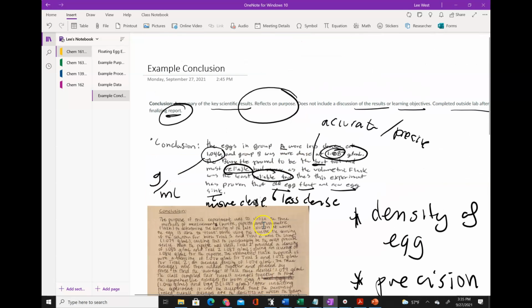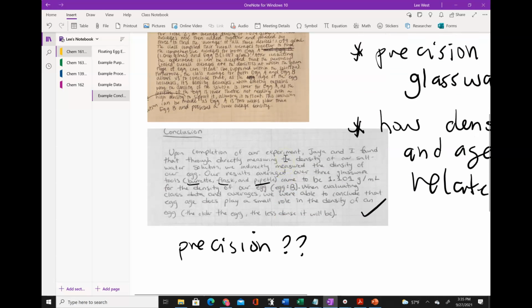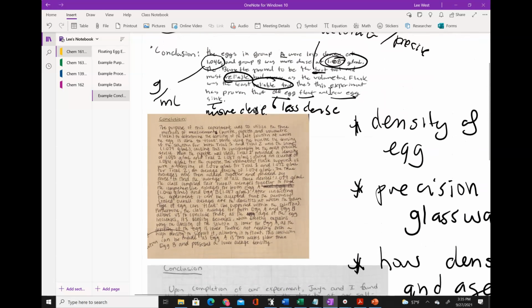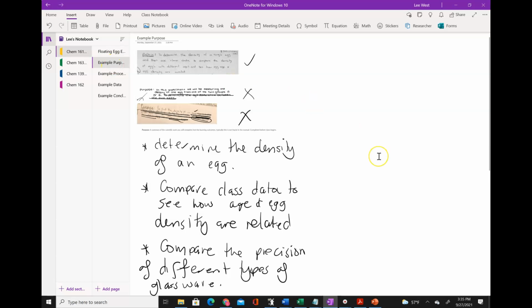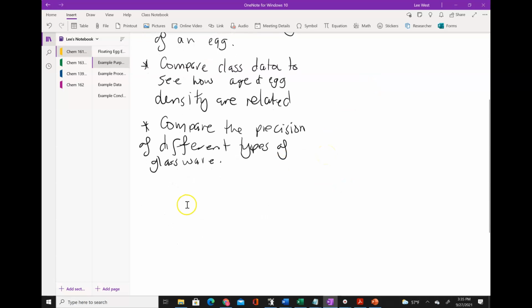All right, guys, so I hope that that kind of helps you get started and gives you some idea as to what is required for your lab notebook. And in particular, remember that you need to get the purpose and the procedure done before you arrive at the lab, and you are welcome to send me a draft if that helps you out.